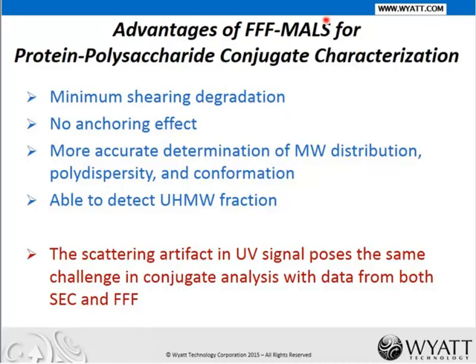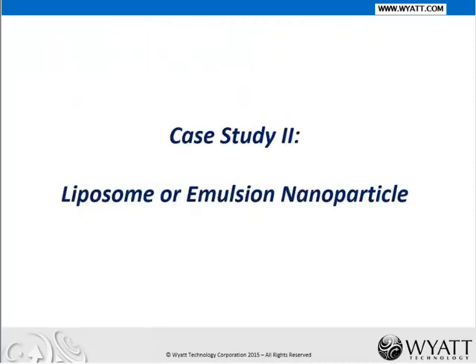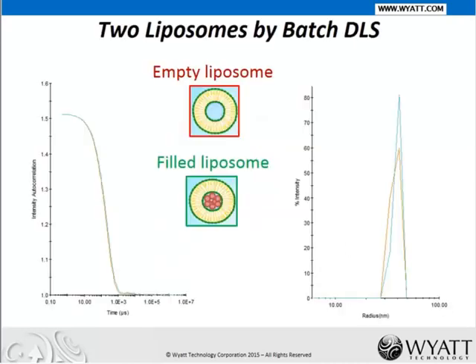The second case study is with liposomes and emulsion nanoparticles. Those are candidates for adjuvants and can also be used as vaccine carriers. So we have two liposomes here. One is empty, the other is filled.